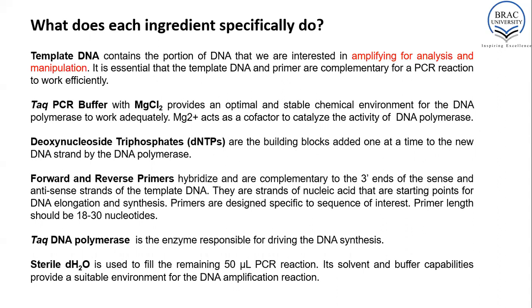So just check what are the components we are using, and what are their roles in the PCR experiment. The DNA template actually contains the target sequence. Normally double-stranded DNA is used for the PCR reaction, but single-stranded can also be used.